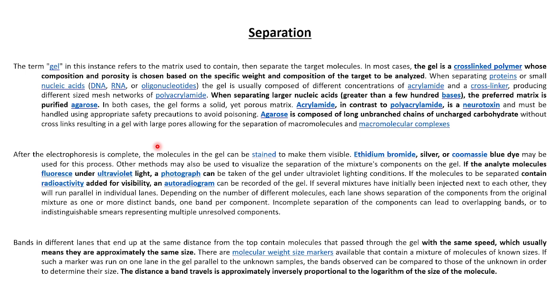After this we run the gel. After the electrophoresis is complete, we need to check these gels under some kinds of stains or under some kinds of light, like the UV transilluminator. The agarose gel is stained with ethidium bromide. That can also be done when we are previously preparing the gel.